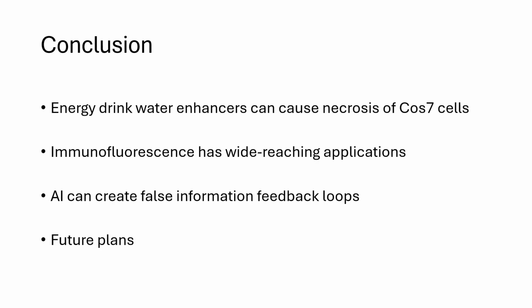In conclusion, energy drink enhancers can cause necrosis in COS7 cells, as shown by the clear annexin-V and propidium iodide stain.